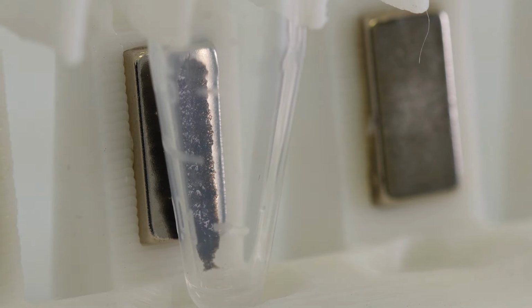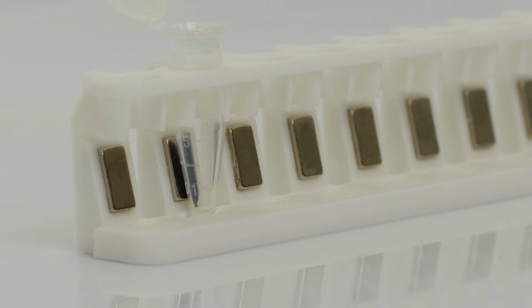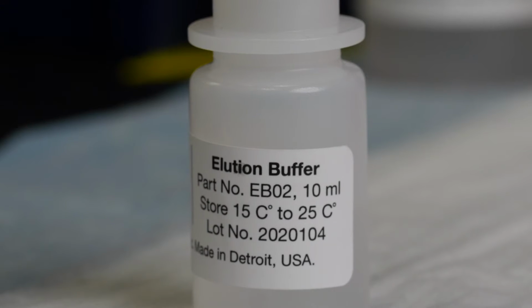It's generally better to err on the side of a longer dry time, especially if your lysis buffer had phenol. If you end up with low 260/280 ratios, often that can be improved by increasing the dry time. Add 50 microliters of water and mix.